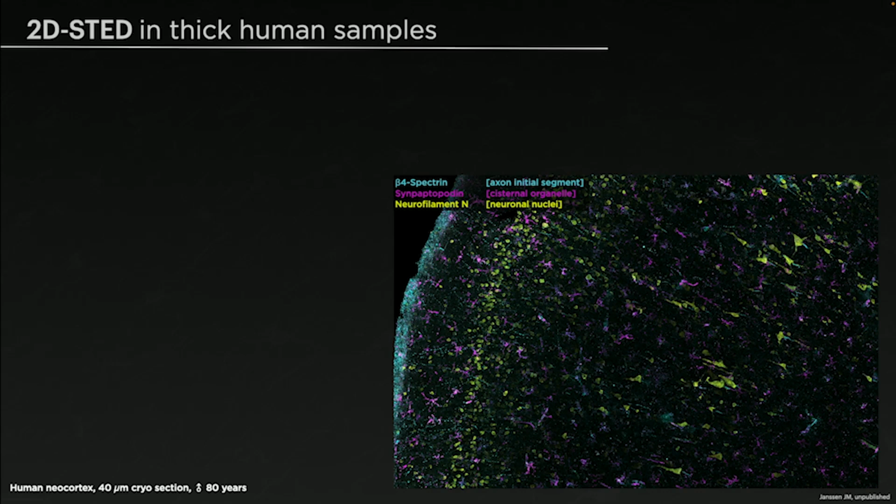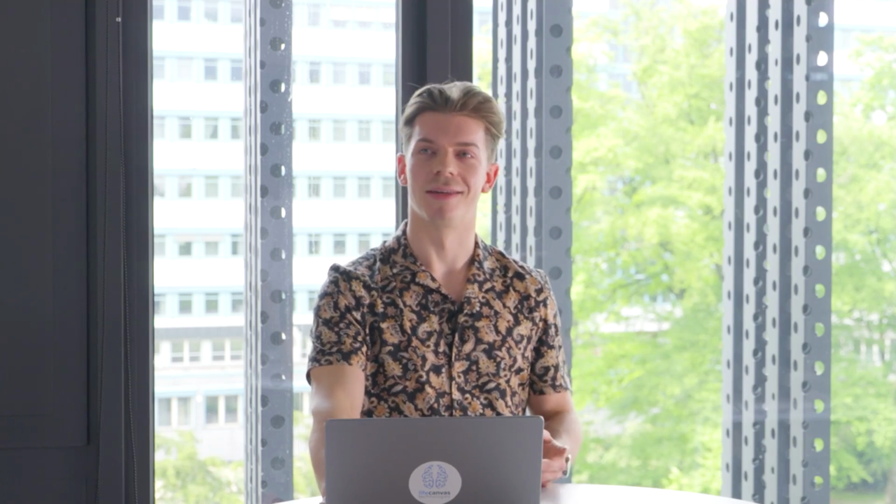So when there is tissue from neurosurgery that has to be taken out by means to get to a tumor or to get to an aneurysm within the brain, we will now use these parts of brain that would have been thrown away before and use them to study healthy neuronal structures and to confirm if what we see in mouse models and in cell culture actually also works the same in human brains.